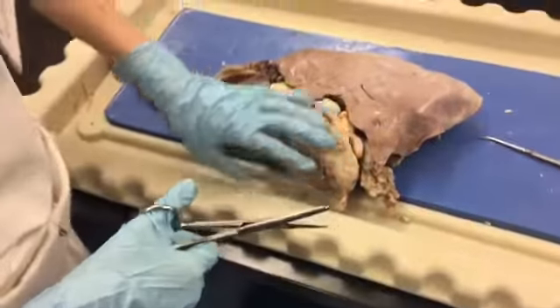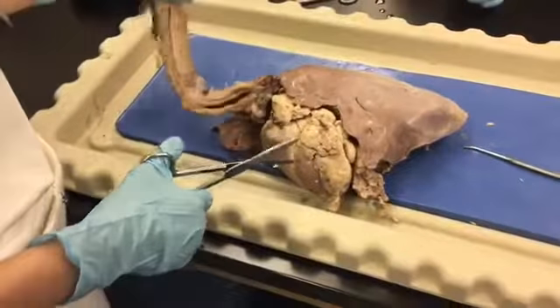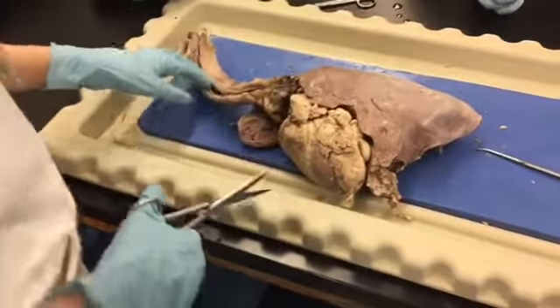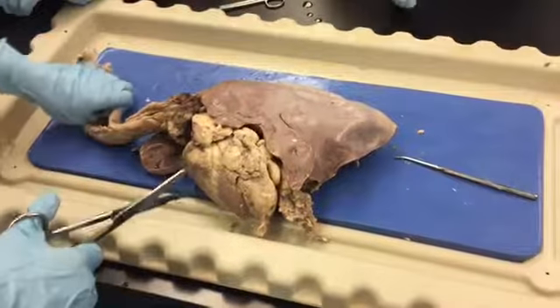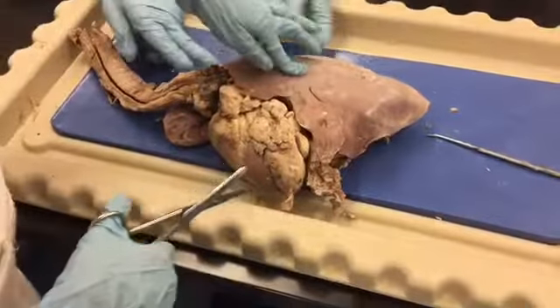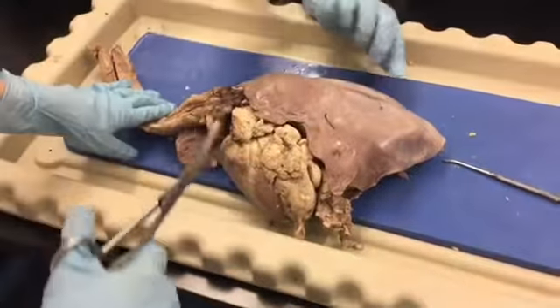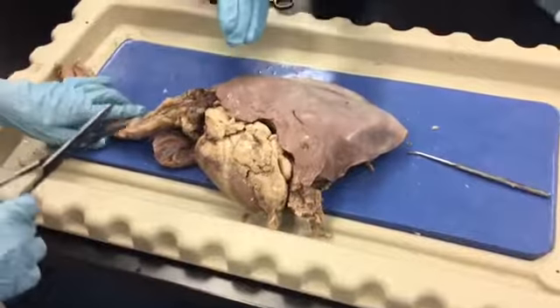But here's the heart, the lungs. Is that the trachea? That's one. I should know this. I took medical biology last year. It is quite squishy. It feels like a mushroom. It's spongy. It's even grosser.